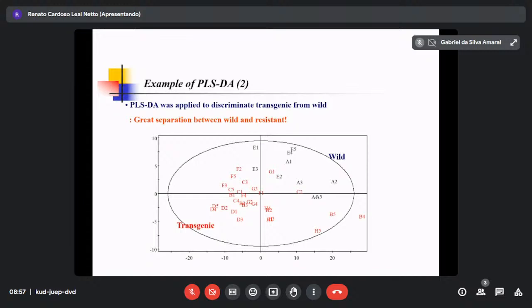Of course, as I told you, principal component analysis is not statistics. It's data reduction. Usually in a paper, I don't draw this Hotelling line because it does not mean anything. But now you have data. For example, Alicia, you have several species, right?